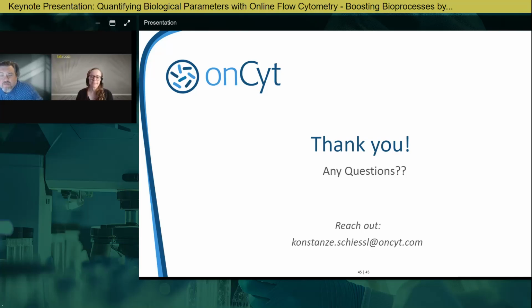Yeah, so it goes a bit back to the overview slide I showed at the beginning. I think Raman and impedance-based sensors can be used for some of the parameters that a flow cytometer can read out as well, like total viable cell concentration. Raman can also measure a lot of biomolecules, but they are less direct, I would say, than a flow cytometer.